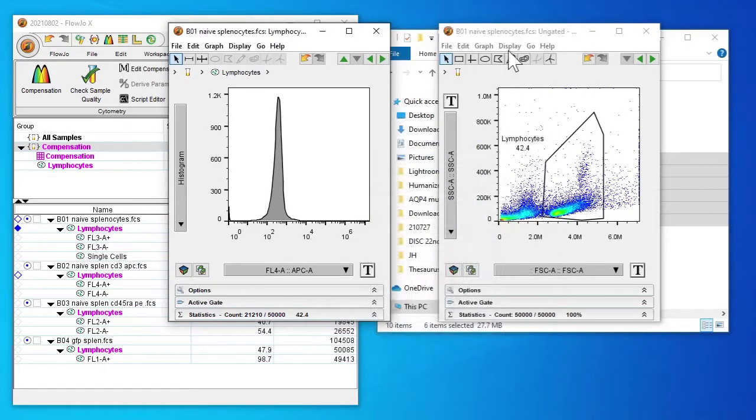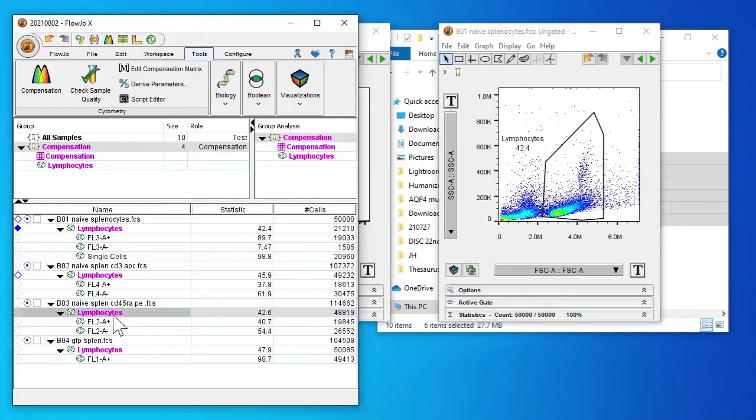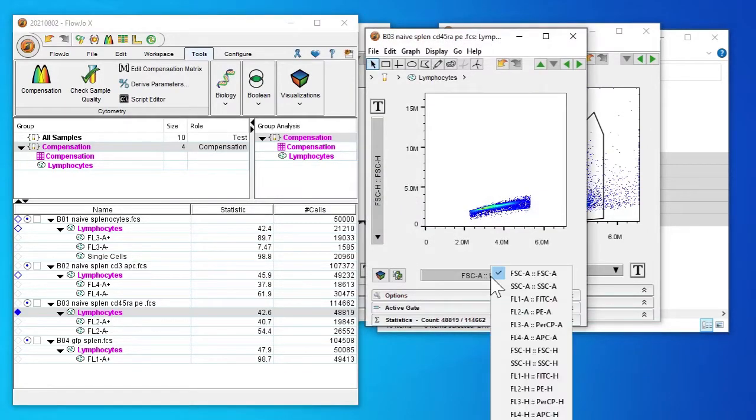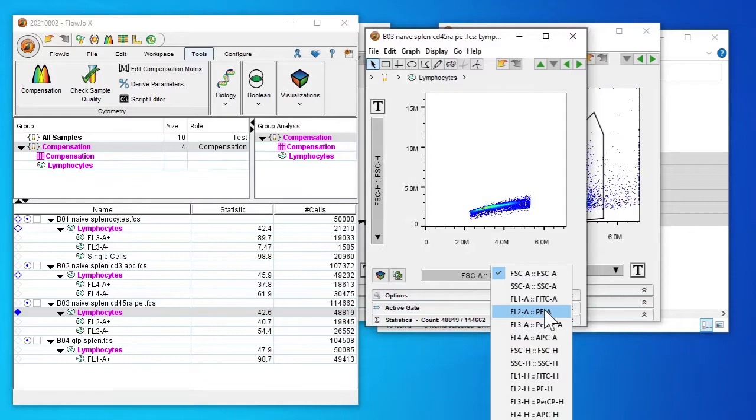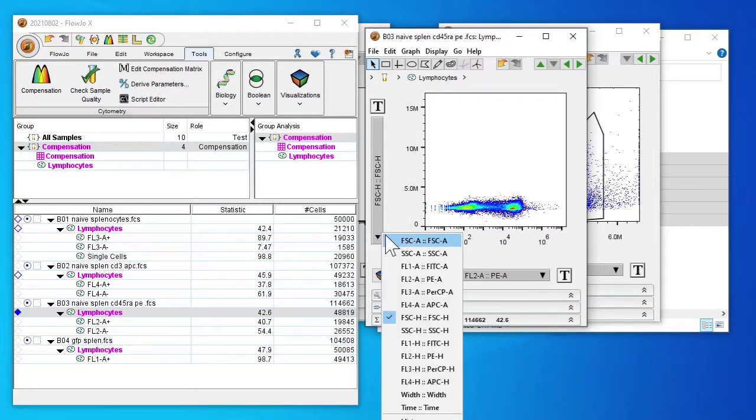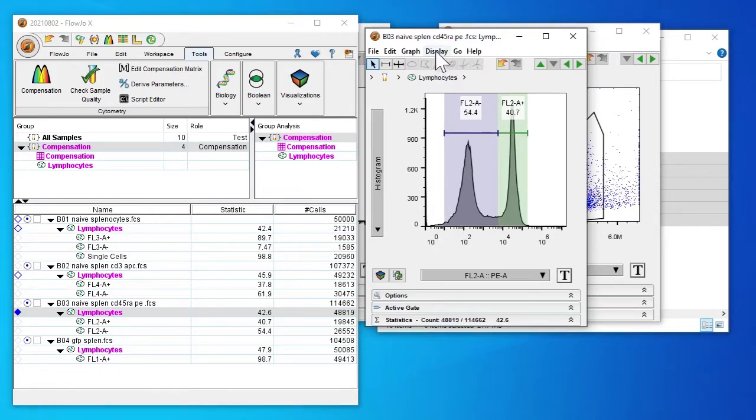Now we're going to need to repeat this with our CD45RA PE. Double click on the lymphocyte, select PE, change the histogram. You see that the computer has already done a good job in automatically detecting the two peaks.